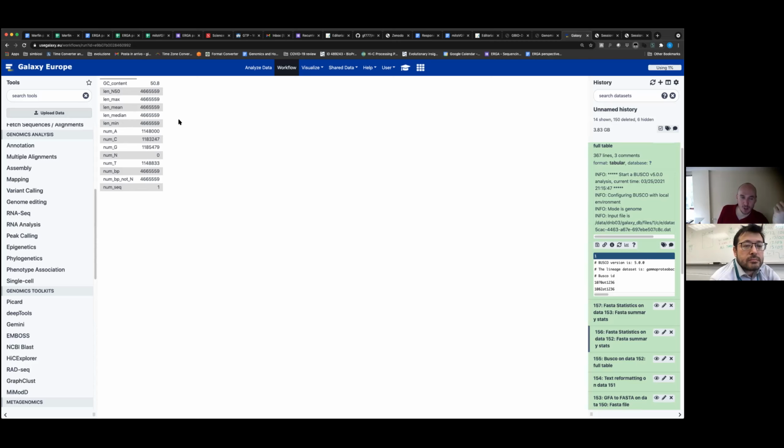That's because there is only one chromosome, and it's about the size of the E. coli chromosome. So it should be pretty much a complete, circularized chromosome with no gaps, and that's pretty good. You see number of sequences 1, and there are no gaps. You see no Ns.